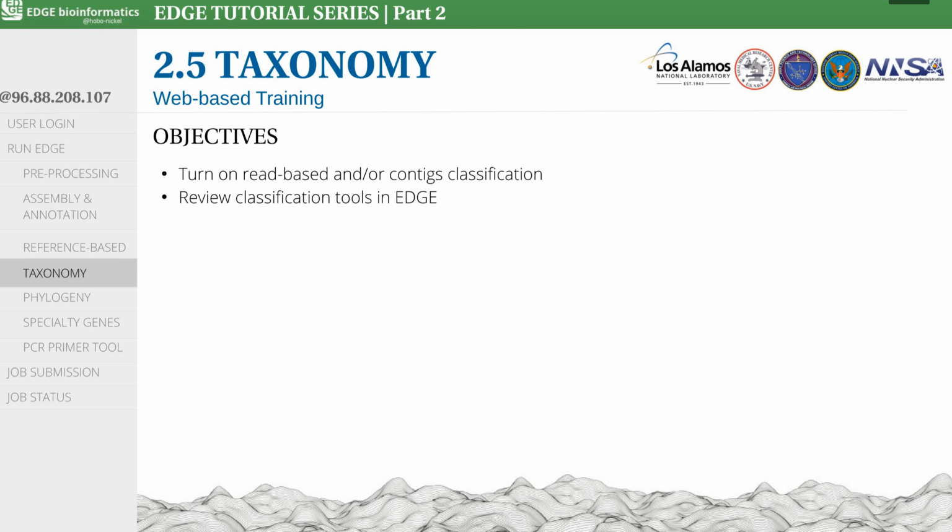The first uses E. coli FASTQ files in the PublicData testData directory in the EDGE interface. The second uses data from the SRA run SRR2164314.